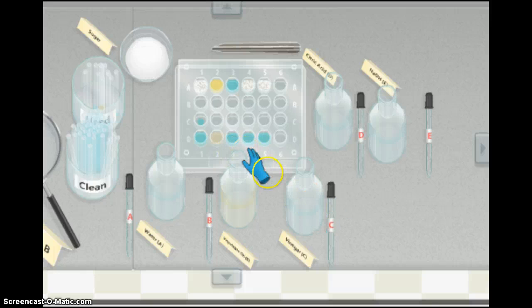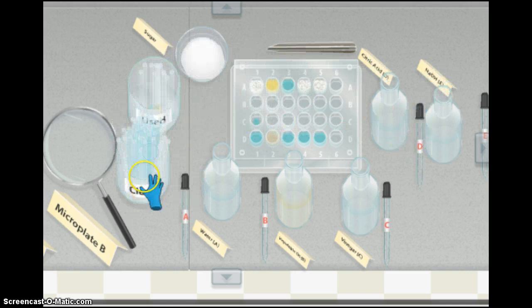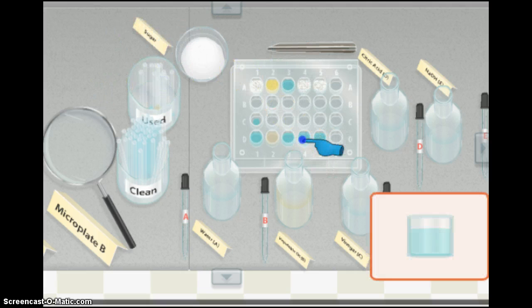And vinegar, we're just adding more of the same. So I'm gonna skip that one. We'll just write NA or skipped on the vinegar and vinegar because you're adding more of the same thing, so we're not gonna notice anything. All right, so let's go ahead and add some more acid to our vinegar. What are you expecting to happen there? So we added two acids together, and yeah, I'm gonna have to go with no visible changes on that one.